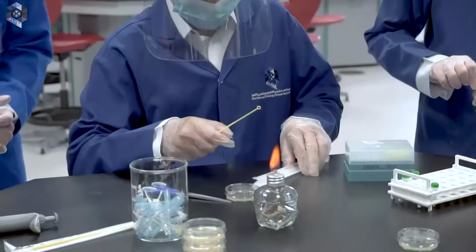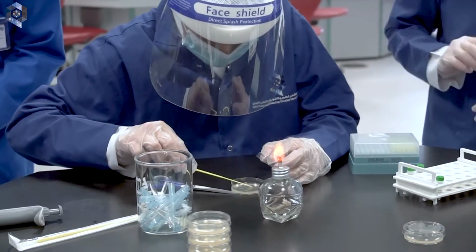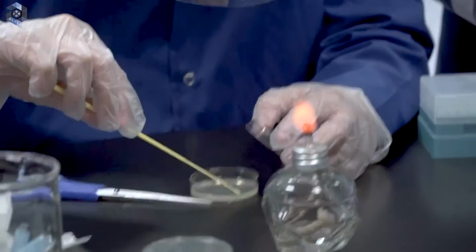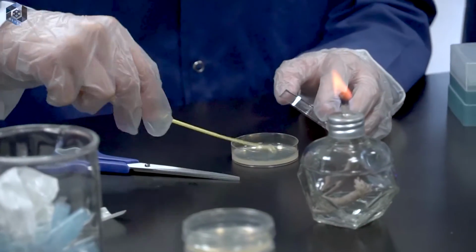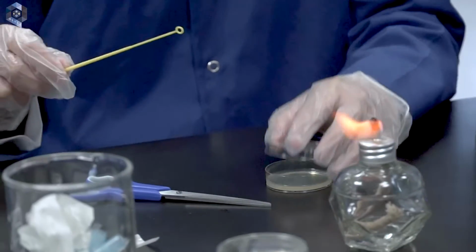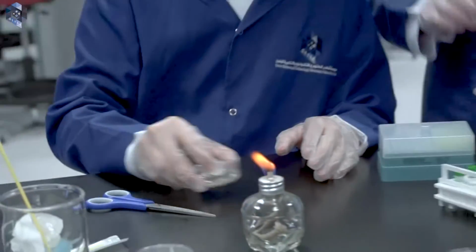The used ones, place in the beaker here. Okay, good. Now, put it aside.